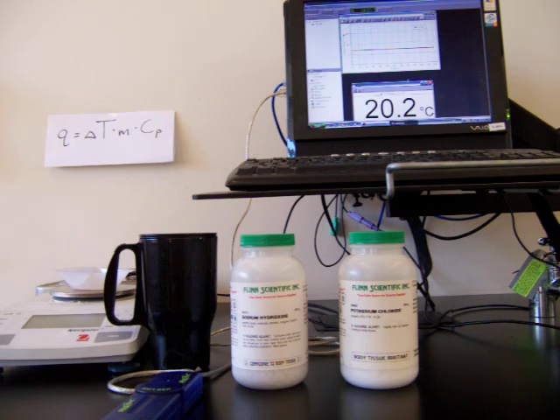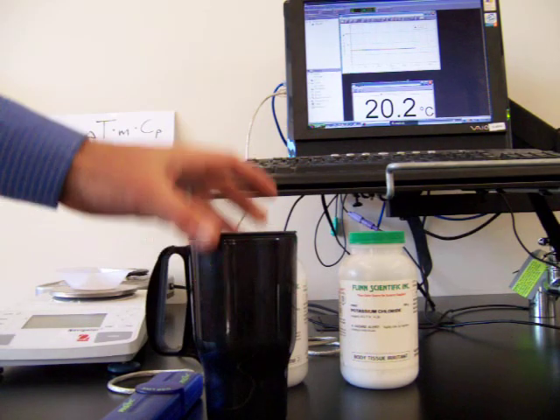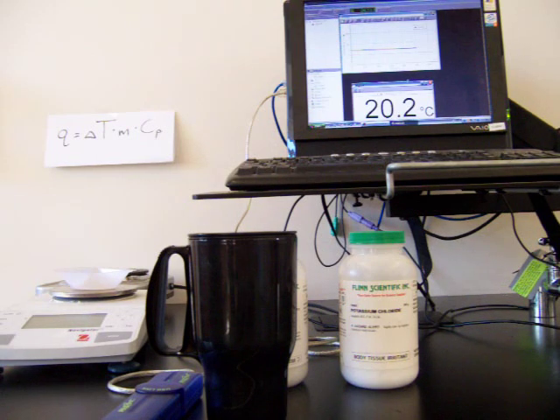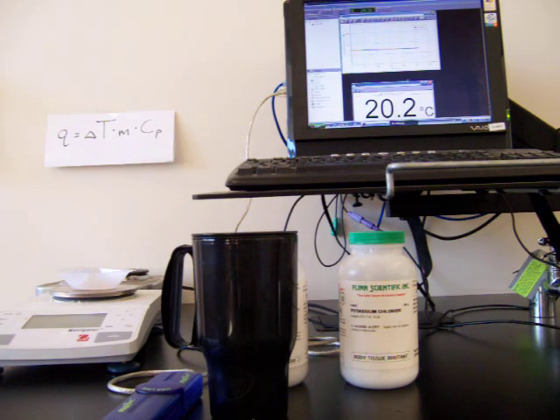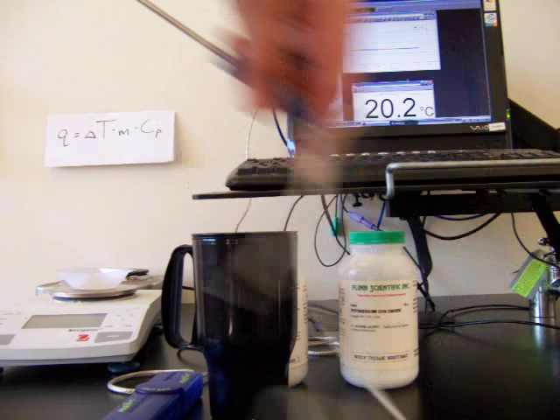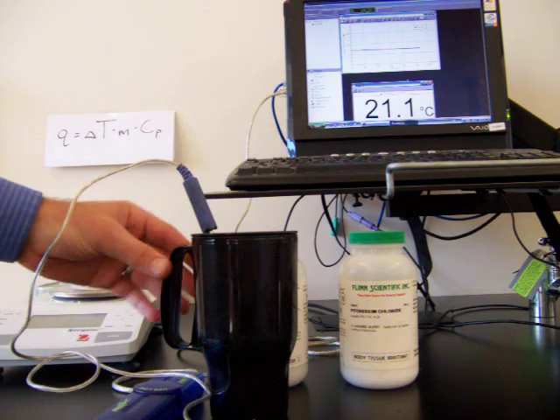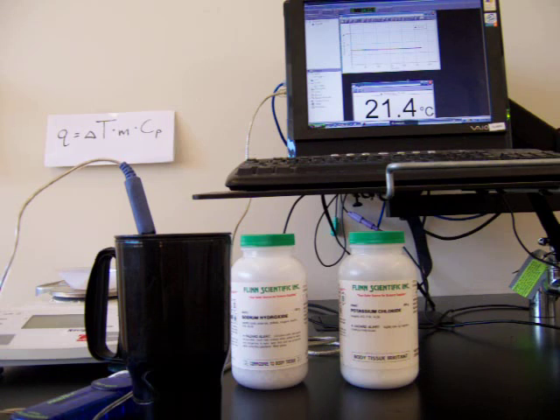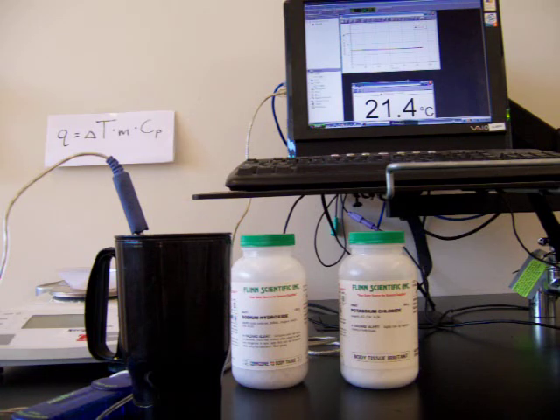Heat of solution is how much energy is released or absorbed as a salt dissolves in water. We're going to use a simple calorimeter — an insulated coffee cup — and we're going to start with 75 milliliters of room temperature water, which is 75 grams of water. We'll find the initial temperature of the water using our digital thermometer. The initial temperature is 21.4 degrees Celsius.